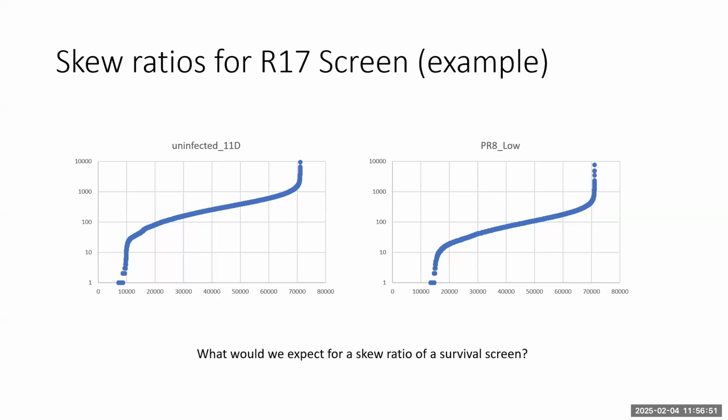We harvested the cells after we resuscitated them, and we did this sequence analysis, and it looked a lot more like almost a straight S line, meaning there was massive skewing. That was because when you resuscitate cells from frozen, there's a lot of cell death, and they just don't like it. You may be able to do it in some cells, or optimize that protocol. We just went, right, we're not doing that again, because the screen after that was completely useless, as the skewing was so bad.